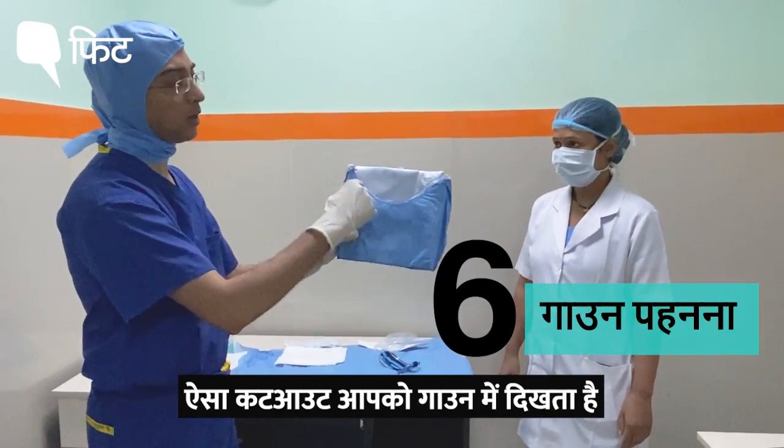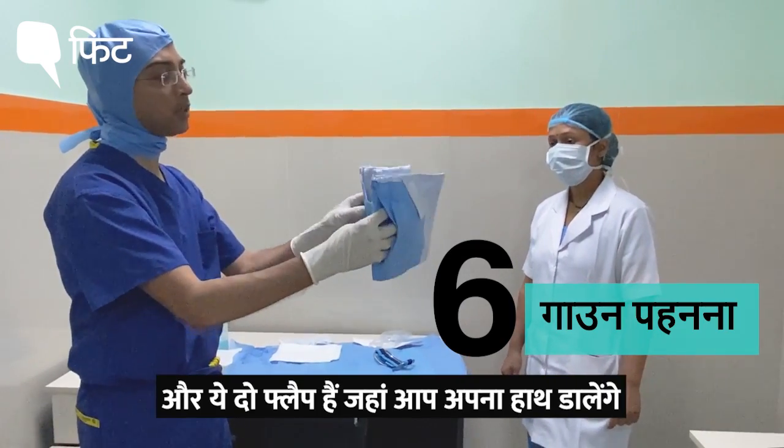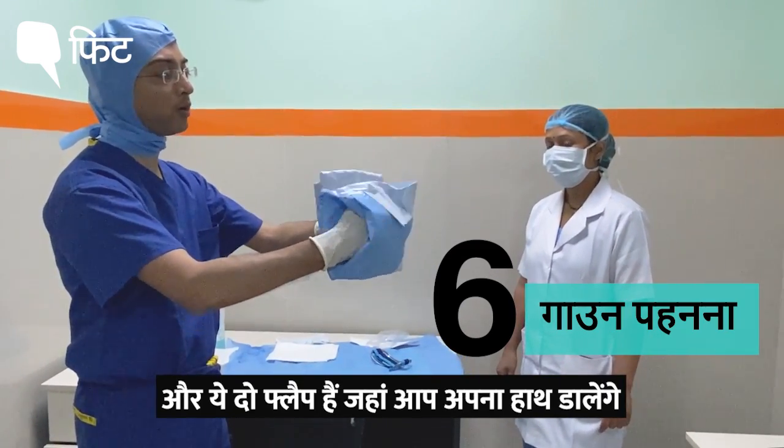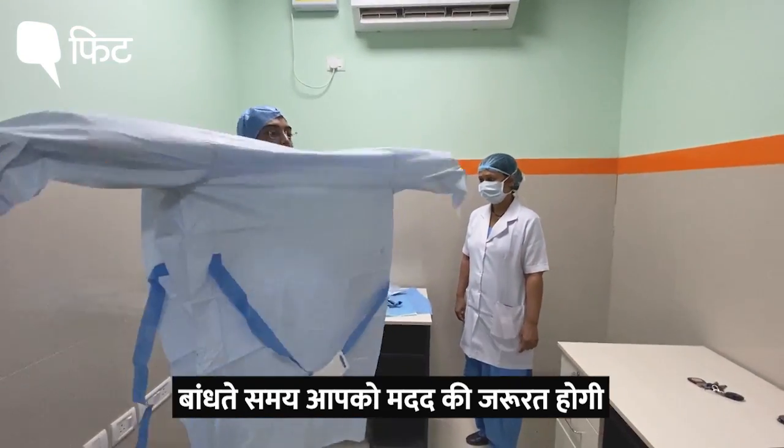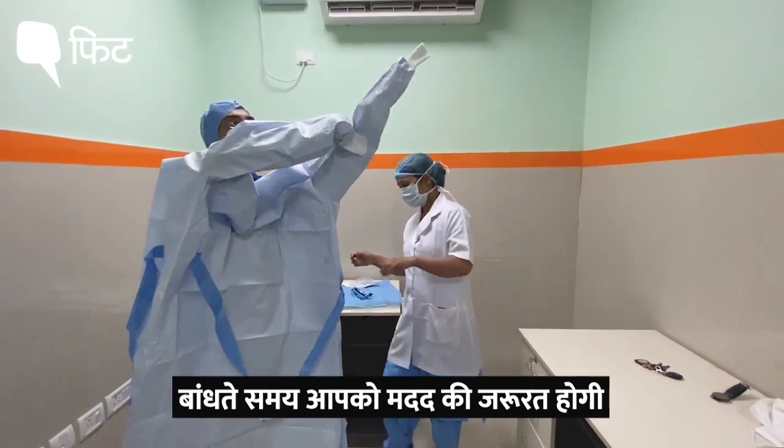This is the cutout that you will see in the gown, and these are the two flaps where you are going to put your hands. You are supposed to put your hand in, and you will need help while tying the gown.